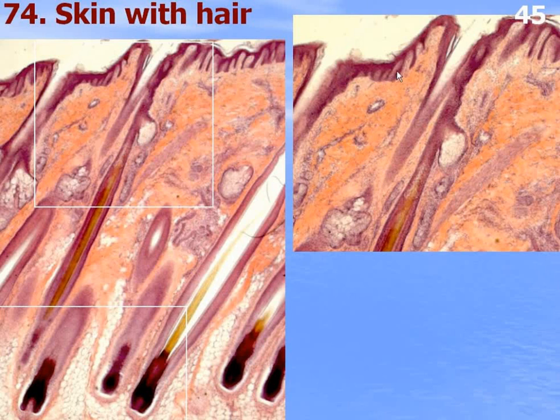The four layers of thin skin epidermis are: stratum basalis, stratum spinosum, stratum granulosum, and a very thin stratum corneum. There is no stratum lucidum in thin skin.